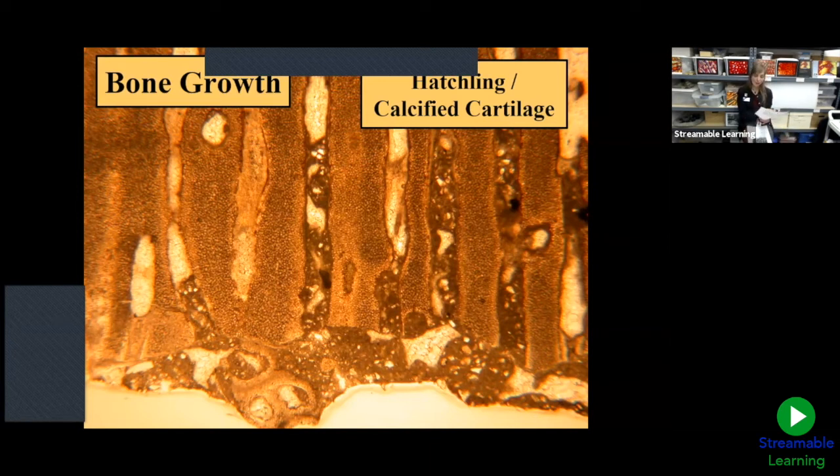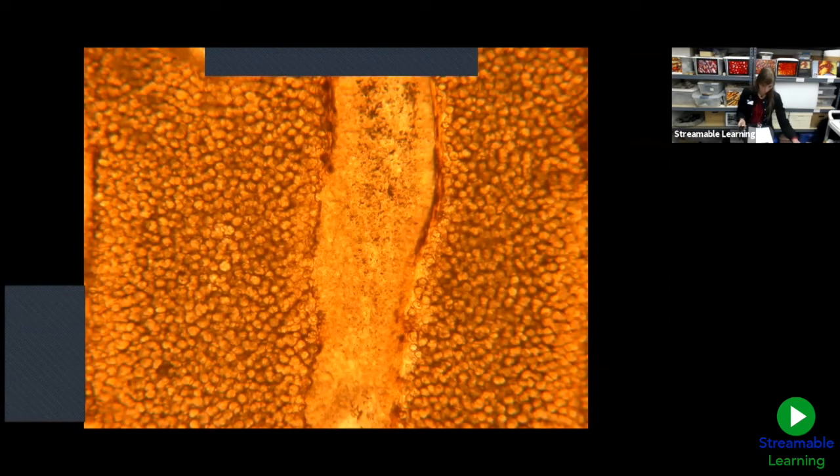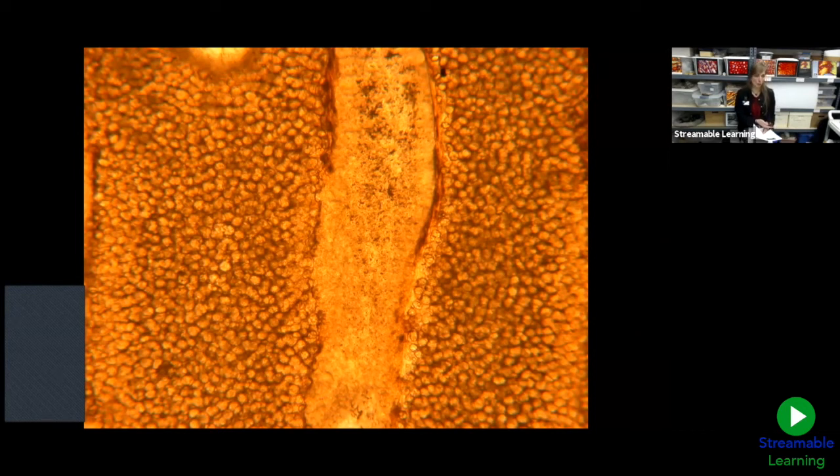Excellent. Well, fossil and geological evidence from this locality showed that Maiasaura traveled in family groups, which allowed many ages of the same dinosaur to be preserved all in one place. The high number of fossils in this locality was most likely preserved as the result of extreme volcanic activity. So the photomicrographs you viewed before were showing you dinosaur bone growth right before your eyes. In the hatchling and nestling Maiasaura, calcified cartilage is well preserved and identified by the stacked columnar structures. Here's a view at higher magnification of calcified cartilage surrounding an area of primary bone growth that's just beginning to form.